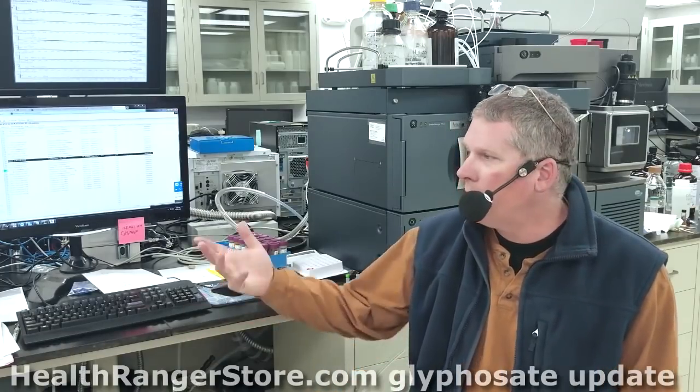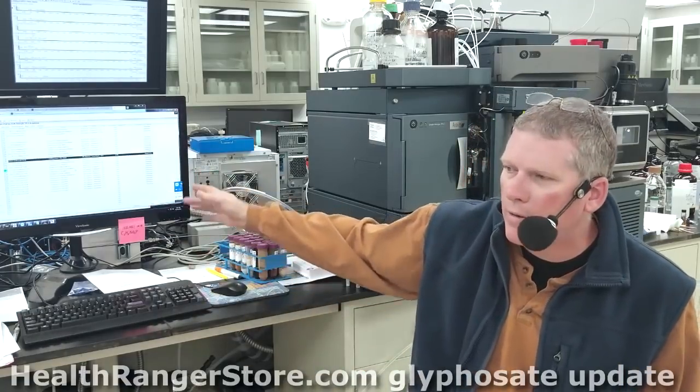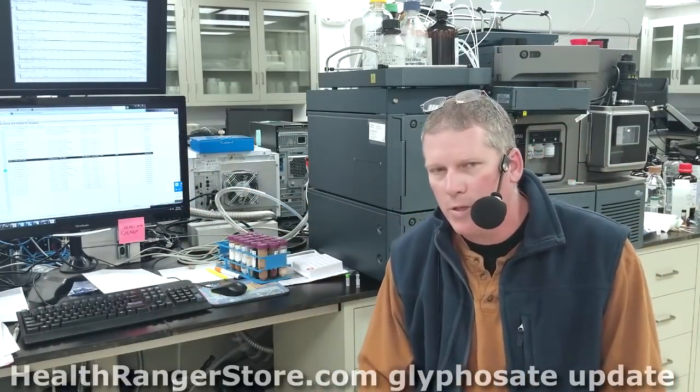And this is our lab here. We have just here within my view, we have 4 mass spec instruments.